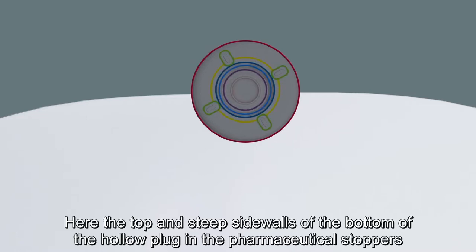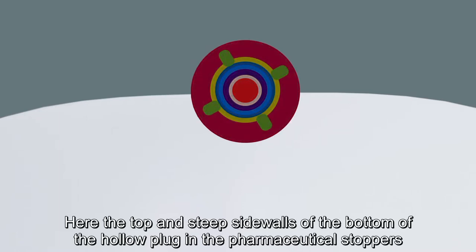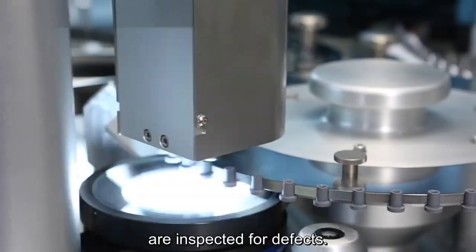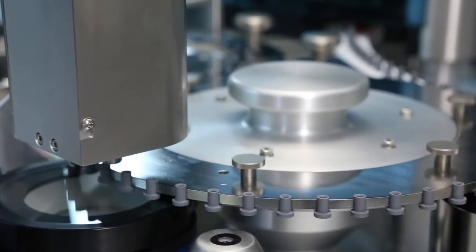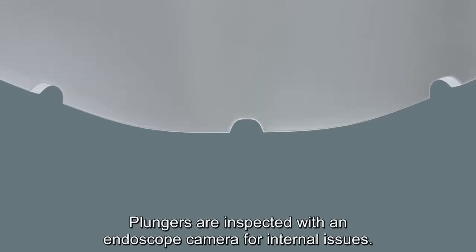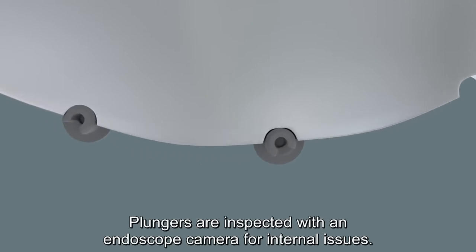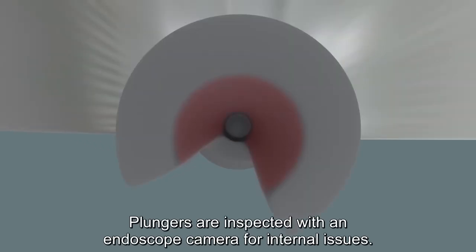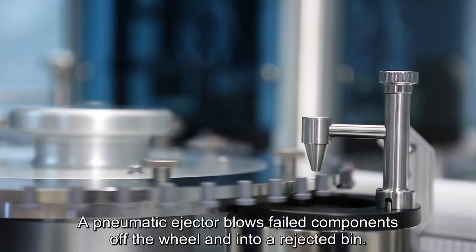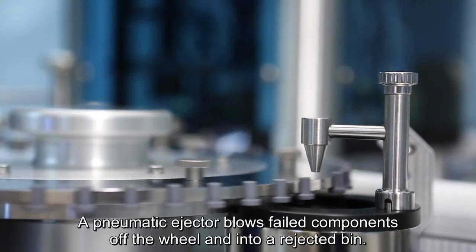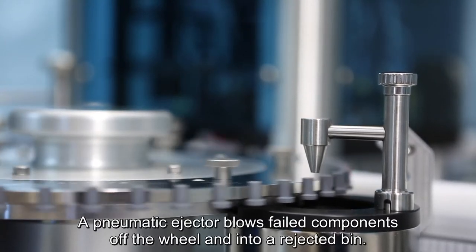Here, the top and steep sidewalls of the bottom of the hollow plug in pharmaceutical stoppers are inspected for defects. Plungers are inspected with an endoscope camera for internal issues. A pneumatic ejector blows failed components off the wheel and into a rejected bin.